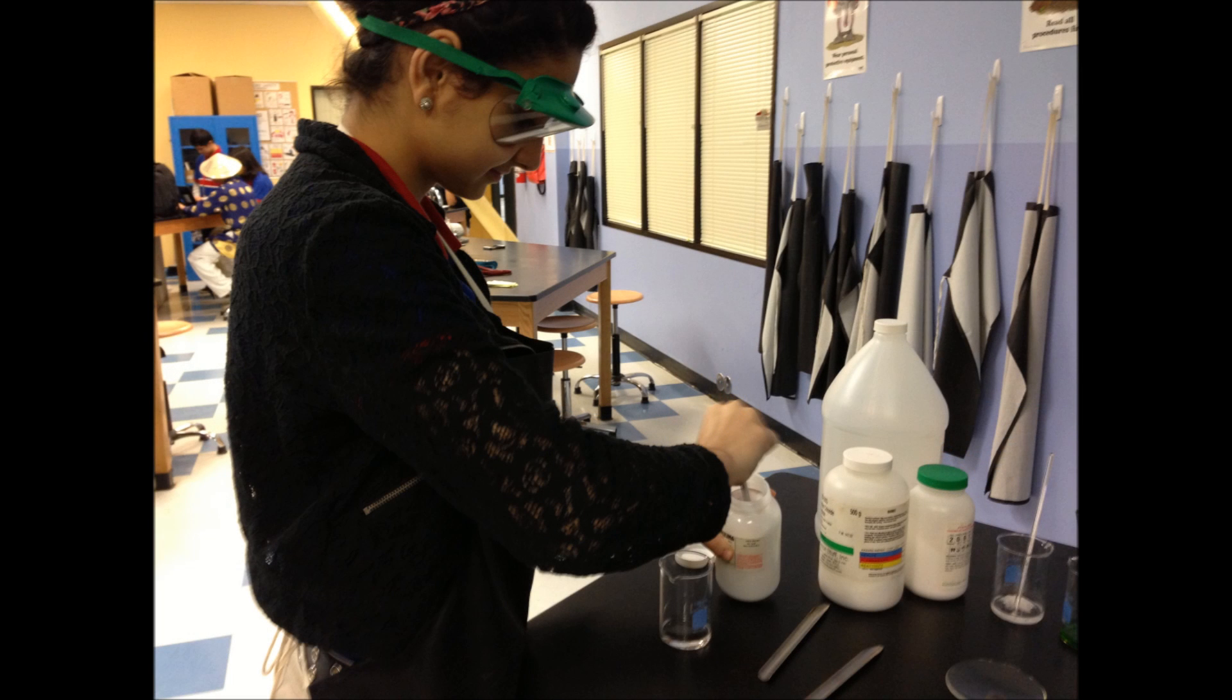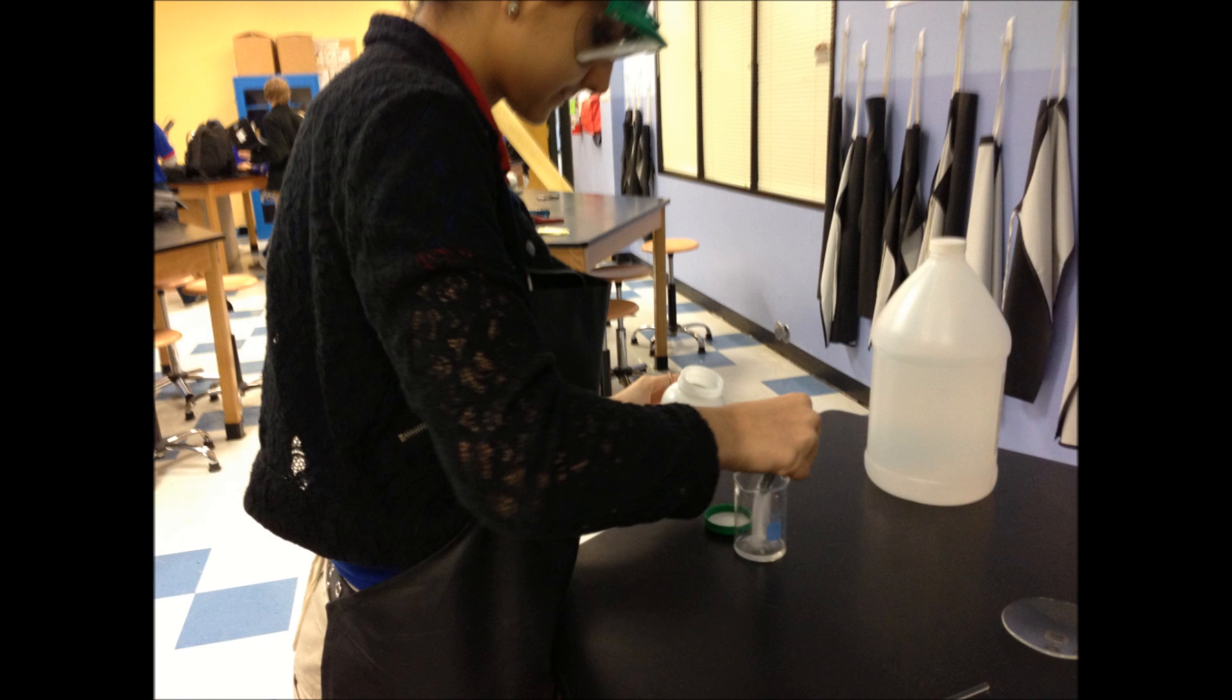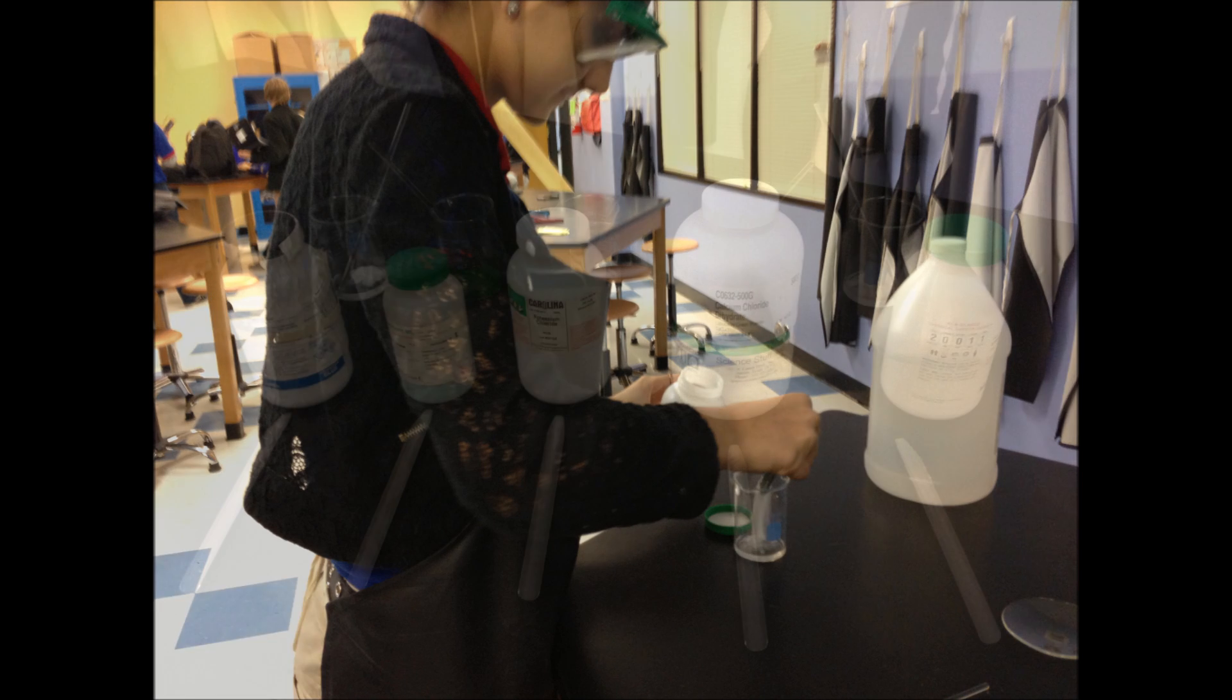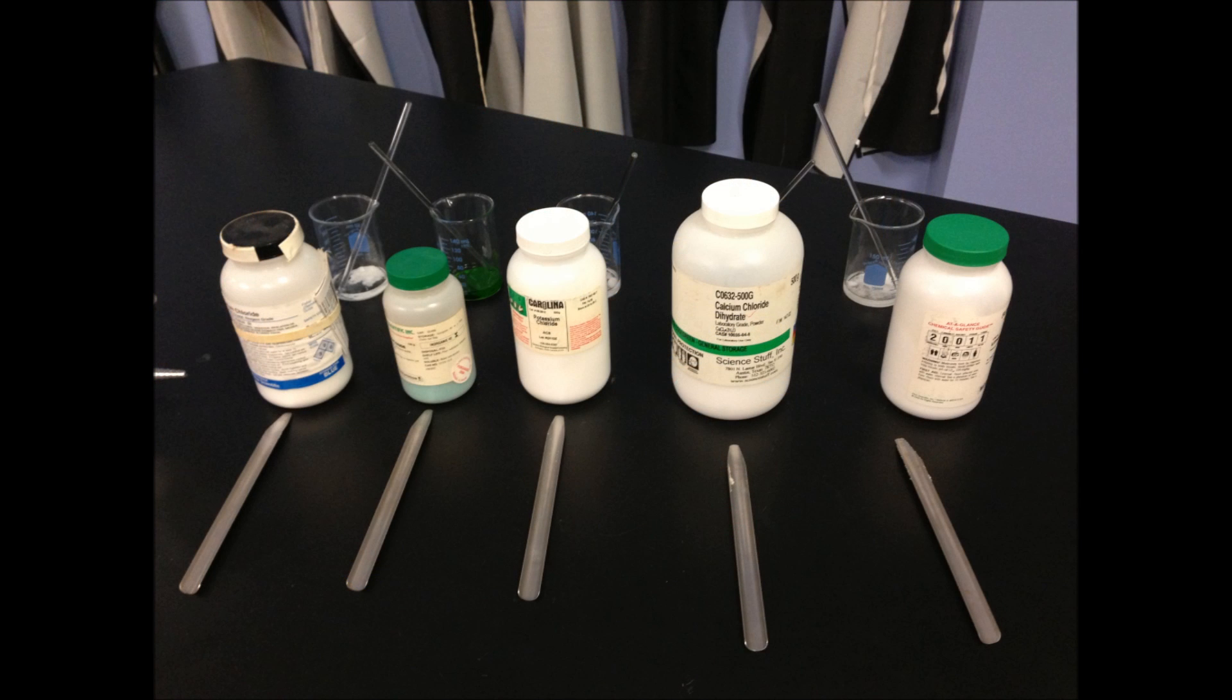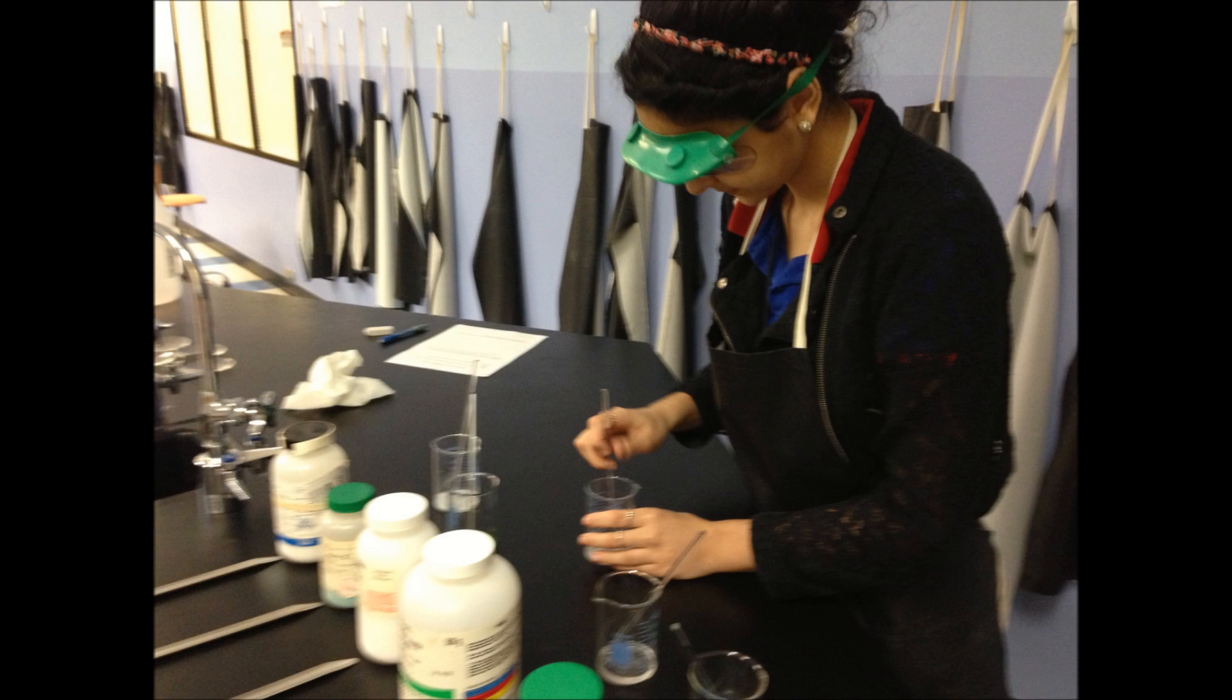To begin, I first added 20ml of methyl alcohol into each of the five beakers. After doing so, I scooped a little of each powder onto each scoop and put it into each of the beakers containing the methyl alcohol. I then mixed the substances together.